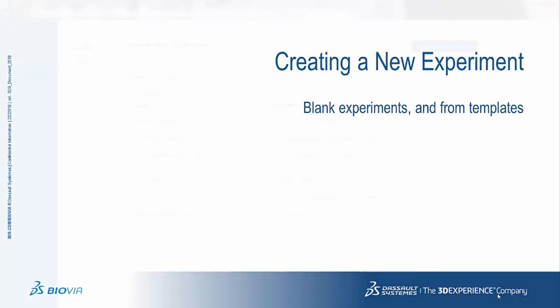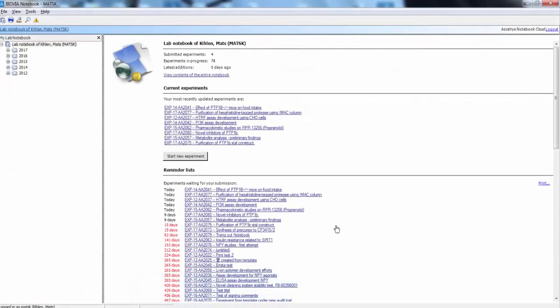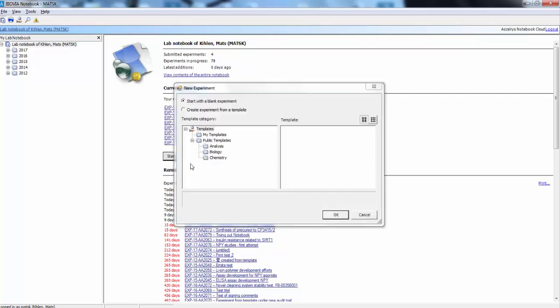To create a new experiment in the Windows client, open up a dialog where you can select to start a blank experiment, or start from a template where you can select from existing templates.